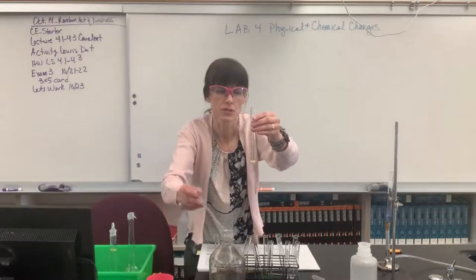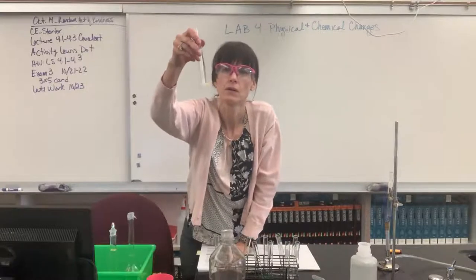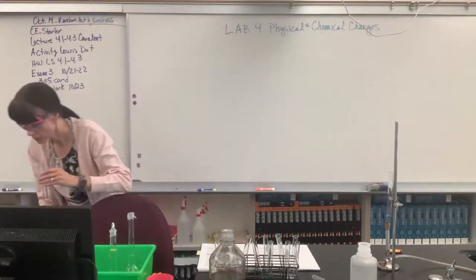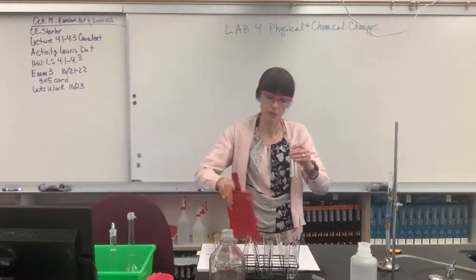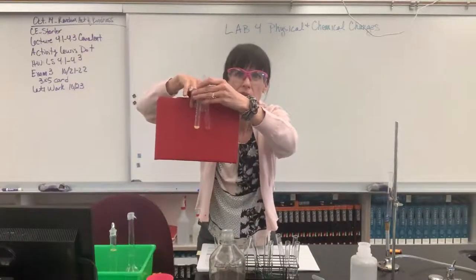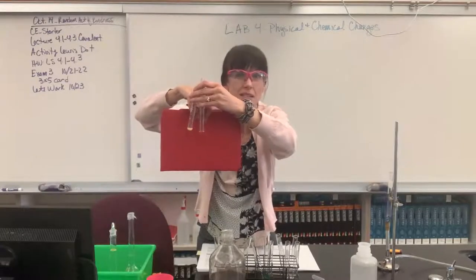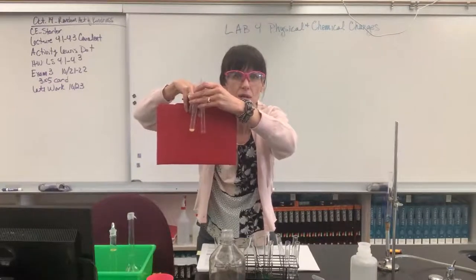1, 2. Ooh, interesting. It is a creamy yellow now. So instead of being clear yellow, it's an opaque yellow that you can't see through it. Let me show you with the red background again. Hope you can see the difference. As you're looking at it, the one on your left is opaque, you can't see through it. But this one on your right, it's yellow, but you can see through it. You can see through to the red background.